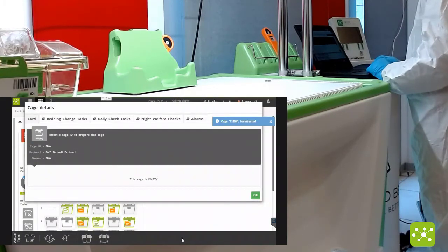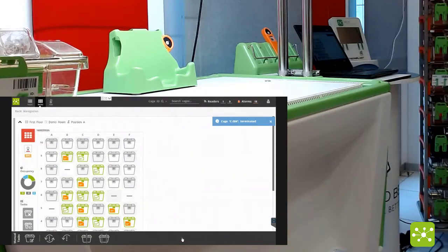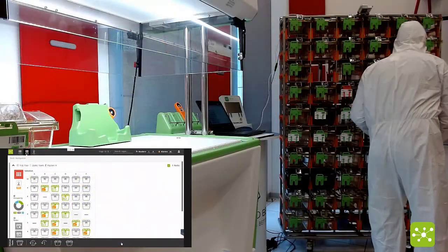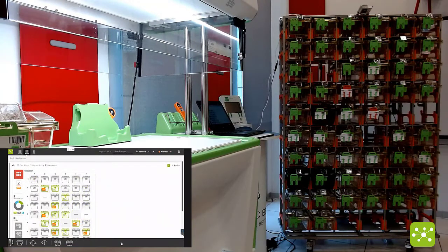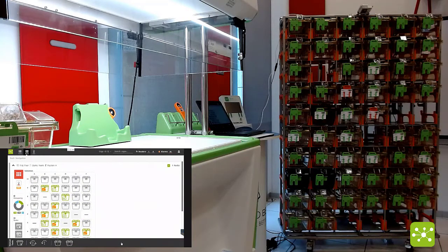You confirm and the cage is now empty and terminated in the system. You can proceed to extract this cage and move the animals out.